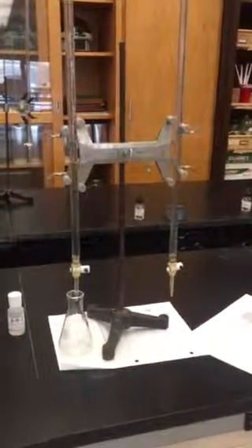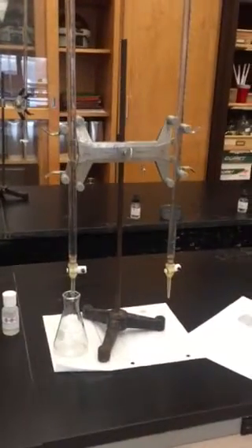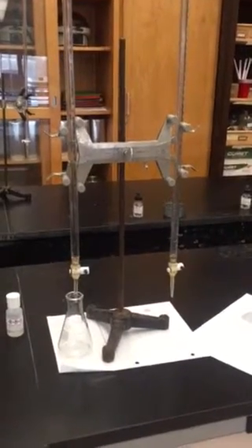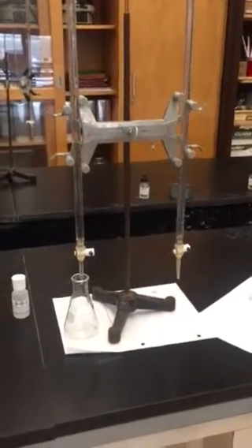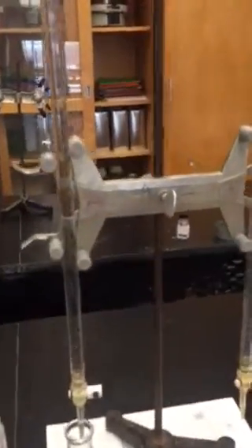Hello, Honors Chemistry. This is the pre-lab for 32: Are all acids created equal? I'm going to make a quick video as a reminder on how to use burettes that we have set up here. When you arrive in lab, you're going to see two burettes. They're going to be filled with an acid and a base.